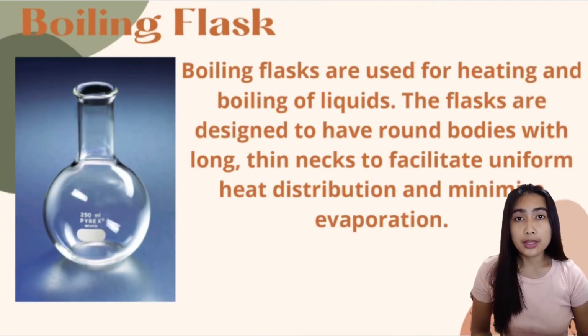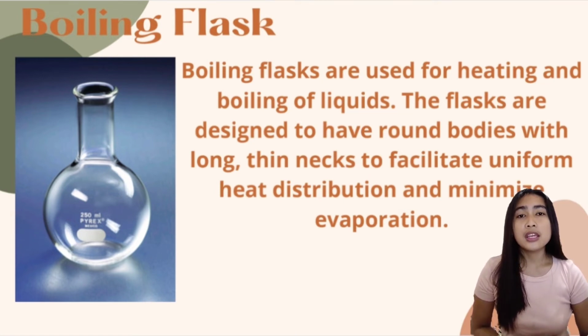Next is the boiling flask. Boiling flasks are used for heating and boiling of liquids. The flasks are designed to have round bodies with long, thin necks to facilitate uniform heat distribution and minimize evaporation.